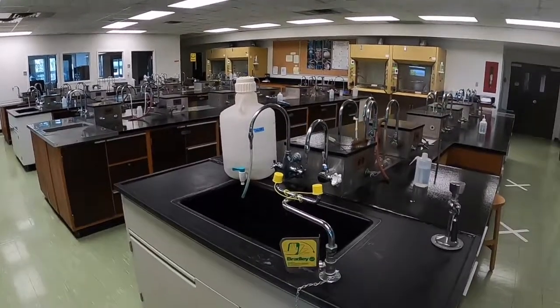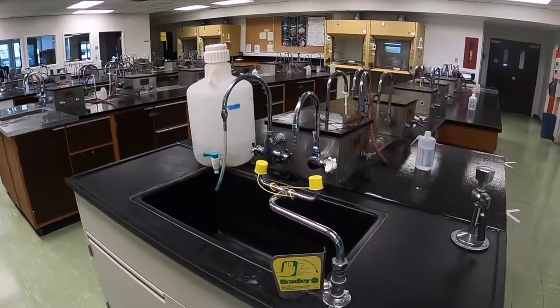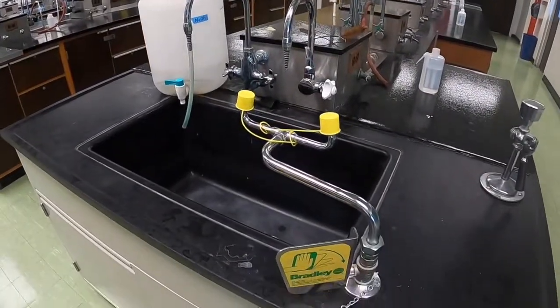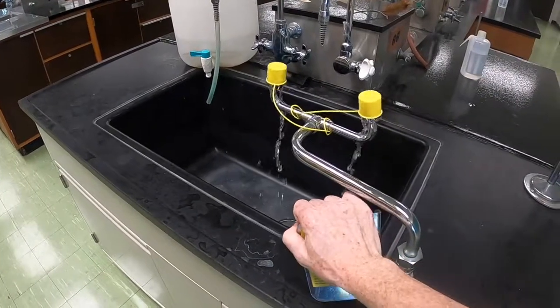We'll demonstrate how to use them now. They're very simple. You simply push the yellow lever down, and when you push the lever down, the water should turn on and you'll be left with two jets of water that you can use to rinse your eyes.